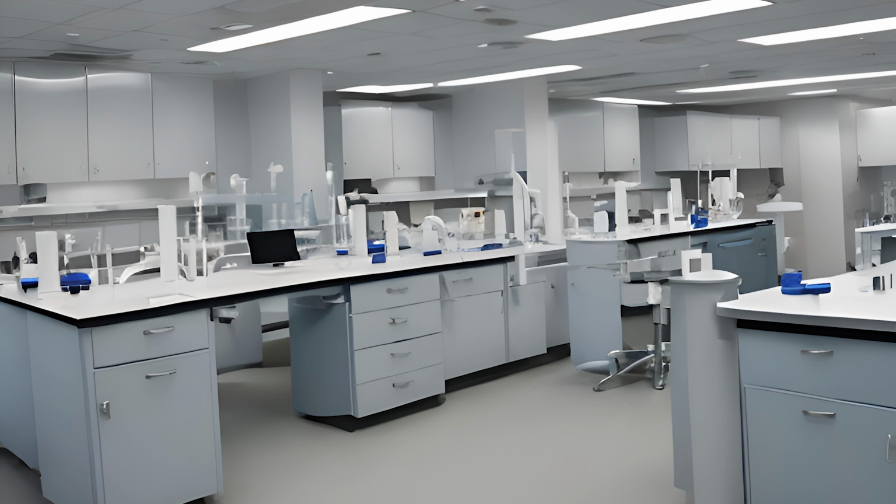Special EPA-approved kits, that's Environmental Protection Agency, are available for cleanup of blood and other body fluids and disinfecting surfaces. Typically, if someone spills a small amount of blood, they're going to clean it up either with a cavicide or a bleach wipe.